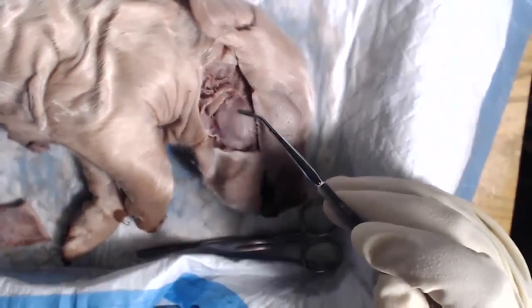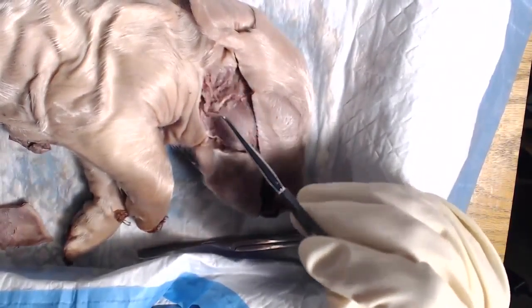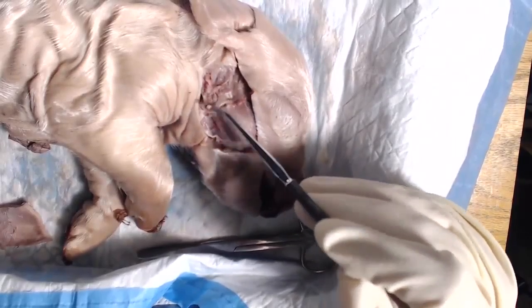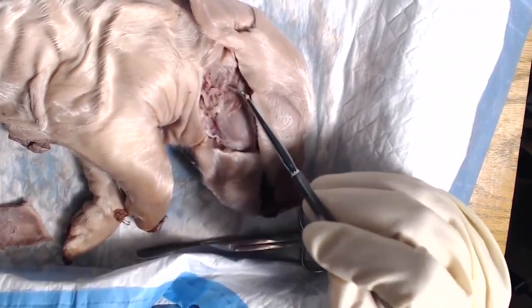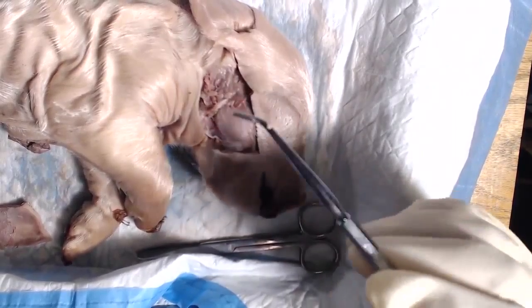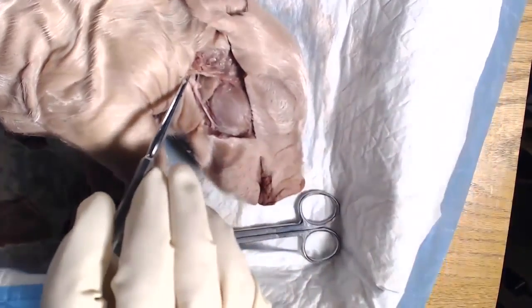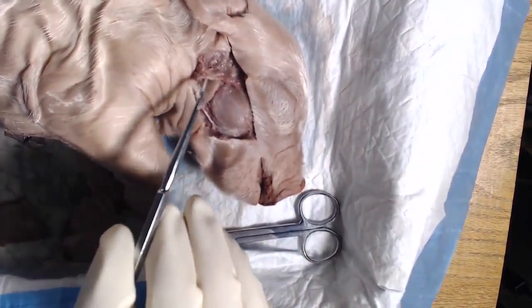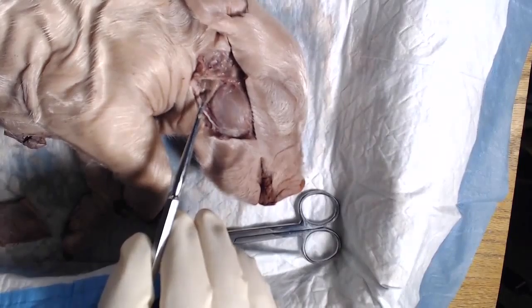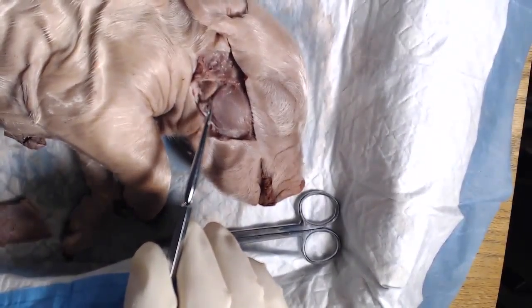Just a quick review. Here's the masseter again. And then behind it right here, this thin, spongy looking tissue. Right behind it is the parotid. And then underneath the parotid, but also behind the masseter, is your submandibular gland right here.